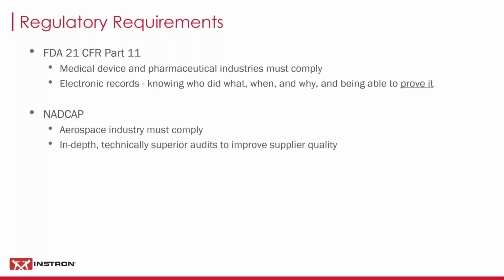So another major regulatory requirement is Nadcap. So Nadcap is found in the aerospace industry. And so this is for aerospace companies that maybe are making composite materials or metals to supply to the aerospace industry. But this requires superior supplier quality, and that's achieved through technical audits.